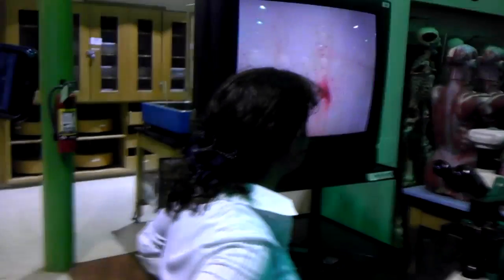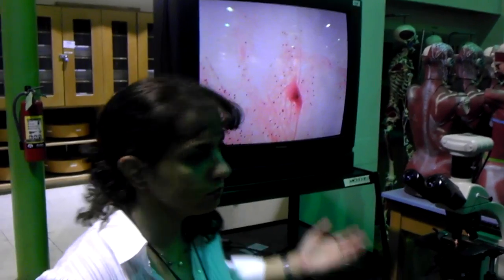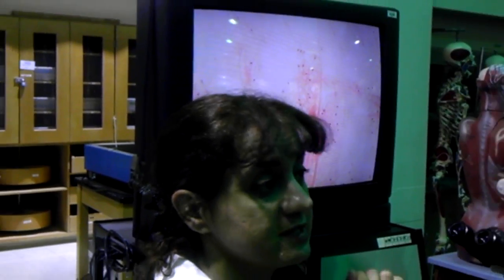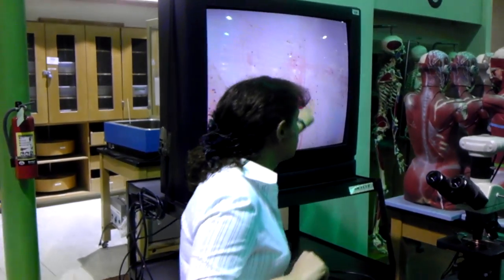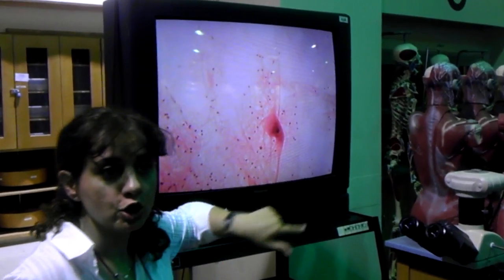To look at them together. The first one is the slide which says neurons smear on it. So it's about the neurons and the structure of the neurons. Actually, it's the nervous tissue. You know that in nervous tissue we have two major types of cells. What are these two? Neurons and neuroglia. So the big guy here is the neuron. Can you see these dark dots? All of these are neuroglia.